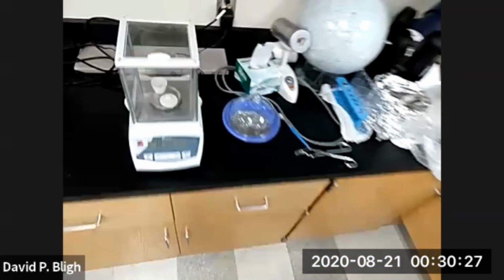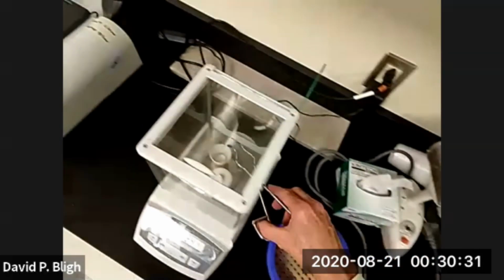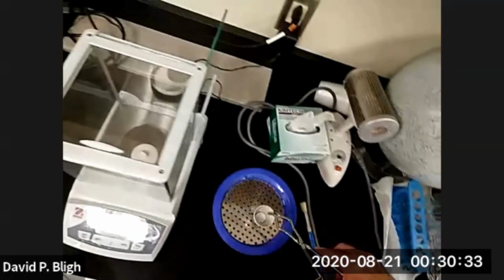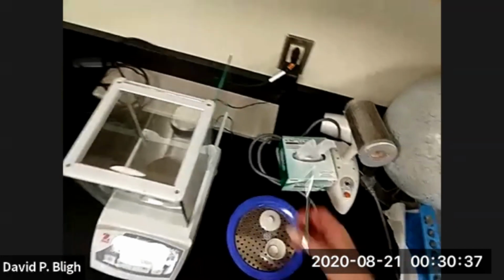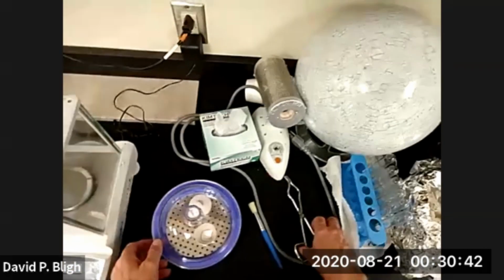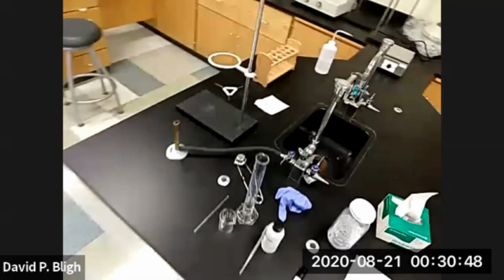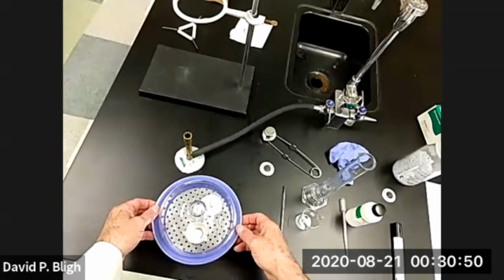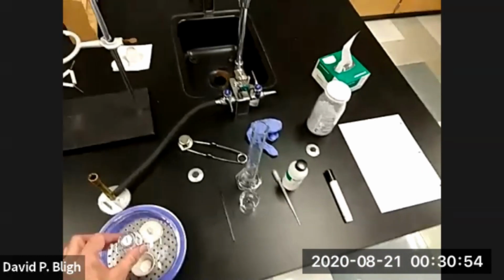And let's transfer this material into the beaker. It needs to be dissolved. Now, why are we doing a Fizz test? Well, if we've narrowed down the products to either sodium carbonate or sodium oxide, then the Fizz test will tell us which one it is.